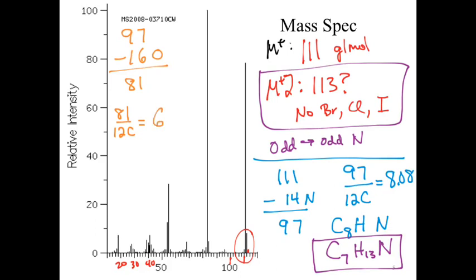6 point something. I don't remember. Apparently I didn't write the number down. Regardless, we get C6. If we count out our mass, we'll notice that we'll have 9 hydrogens, 1 oxygen. Sorry, again, nitpicky with the order, which eventually we'll talk about. And apparently color. And what we have now is a potential formula.